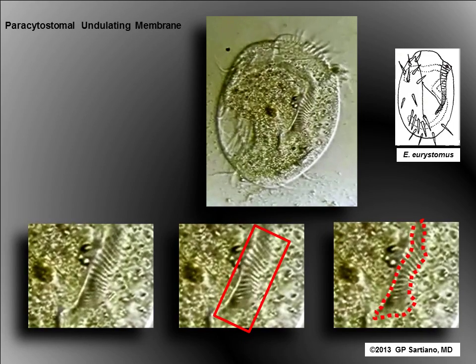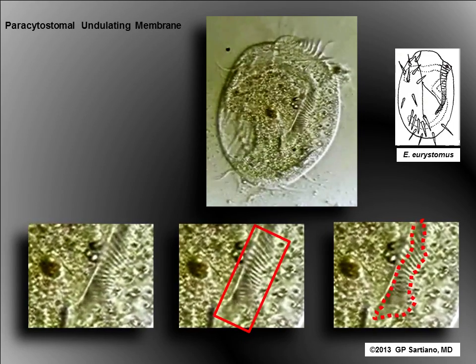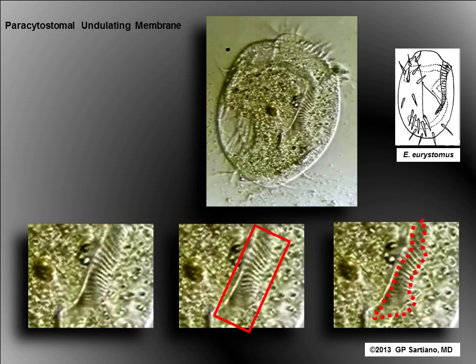The fused distal cilia of the AZM also undulate.